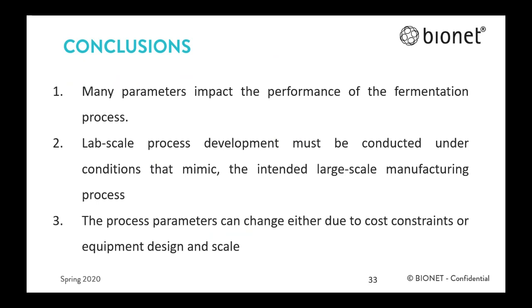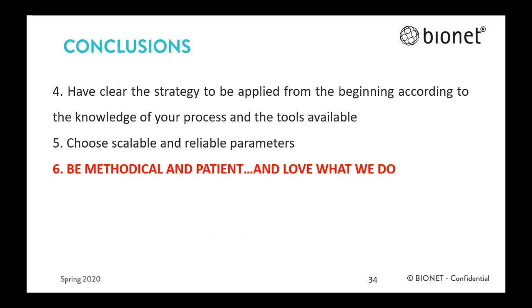The process parameters can change either due to cost constraints or equipment design and scale. Have clear the strategy to be applied from the beginning according to the knowledge of your process and the tools available. Choose scalable and reliable parameters. Be methodical, patient, and love what we do.